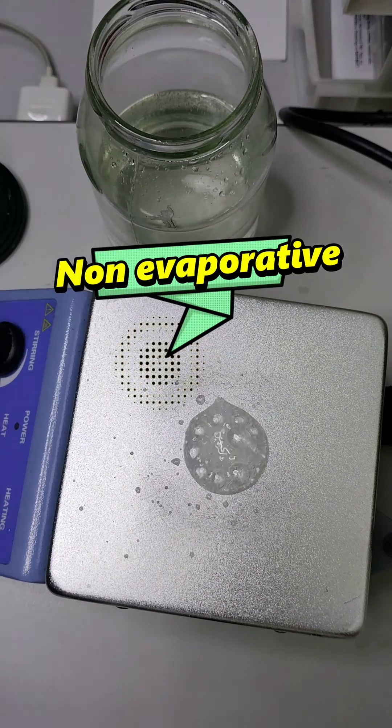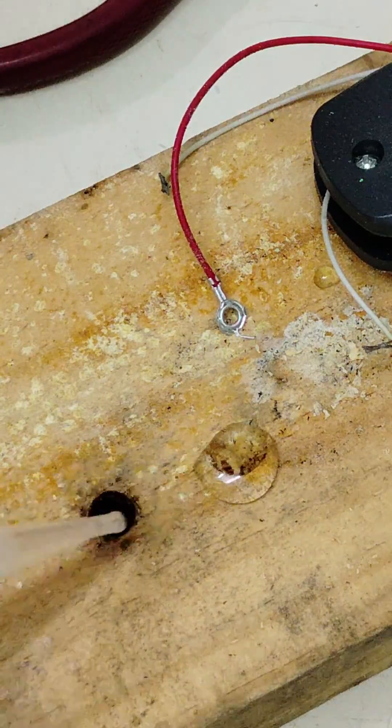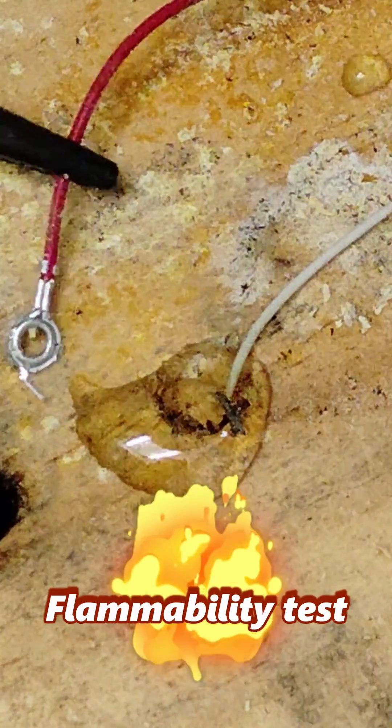By creating your own aluminum ionic liquid, you can tap into its potential in areas like electrochemistry, materials science, and more.